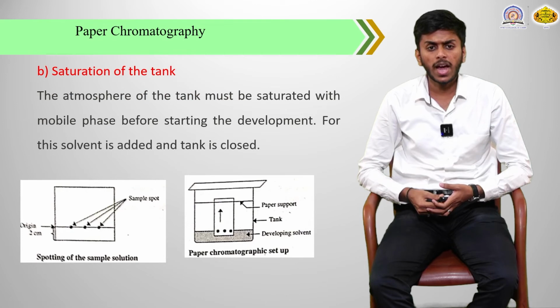Saturation of the tank. The atmosphere of the tank must be saturated with the mobile phase before starting the development. For this, the solvent is added in the tank and the tank is closed with the lid.